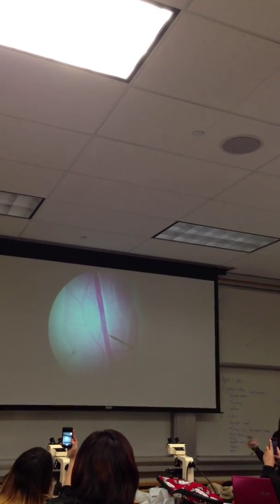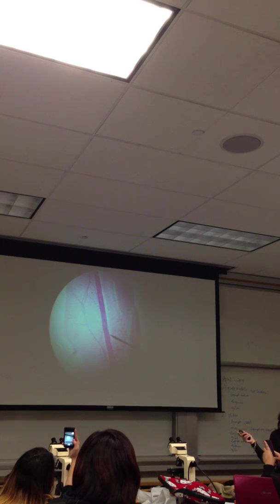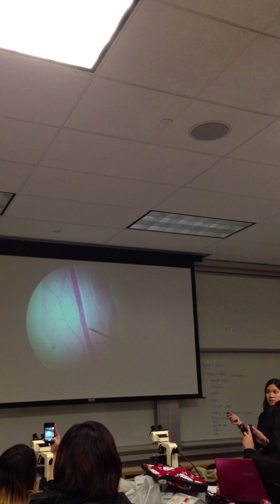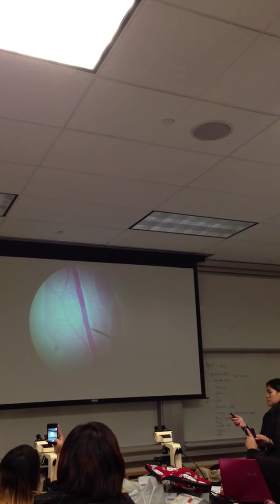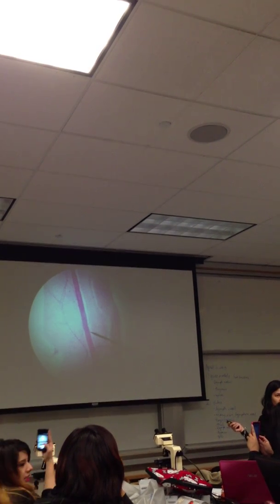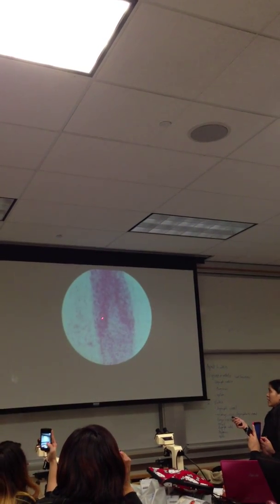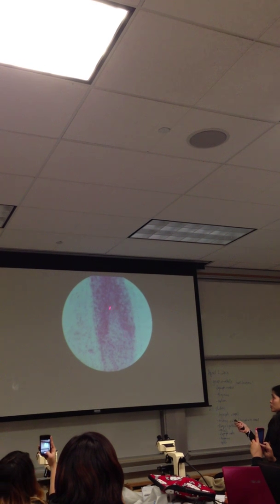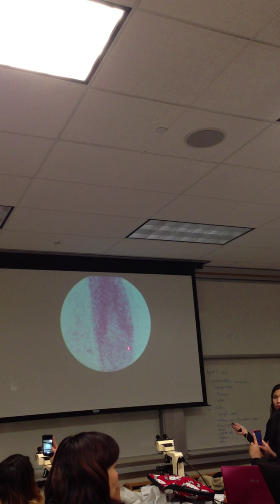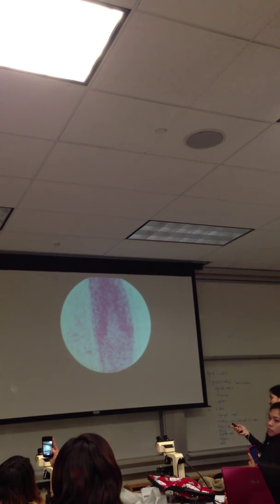And so this is going through the tissue, and it allows for, again, we talked about this in lecture, right? How it allows for just one way, okay, because of the valves. Okay? All right, so you shouldn't mistake this for anything else, right? Okay. And this is a close-up view, and there's that V-shaped valve. Okay? All right.